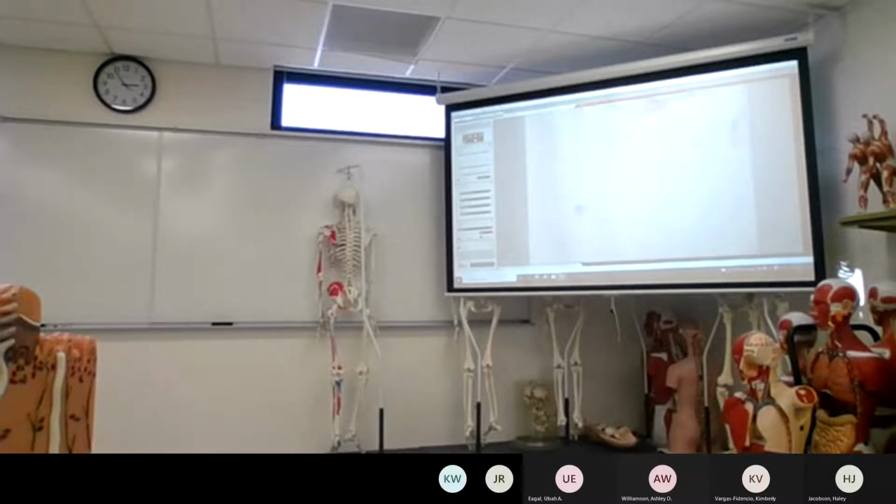All right, so again, I can't see this one all that great. Mine's a terrible slide. If you want to pull out the slide again, all right, wait, maybe it's backwards. We should have a neuron. All right, spinal cord, there it is.